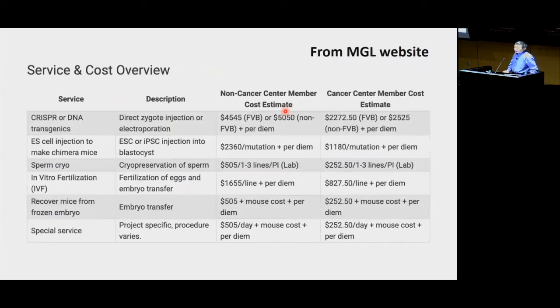That's a very tough question. It's very specific to your project. Let's say you want to flox a very short sequence, say a 1 kb fragment or maybe less, I will definitely say try the CRISPR. It works efficiently.